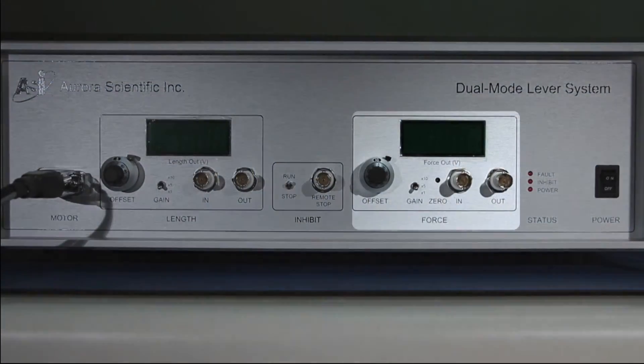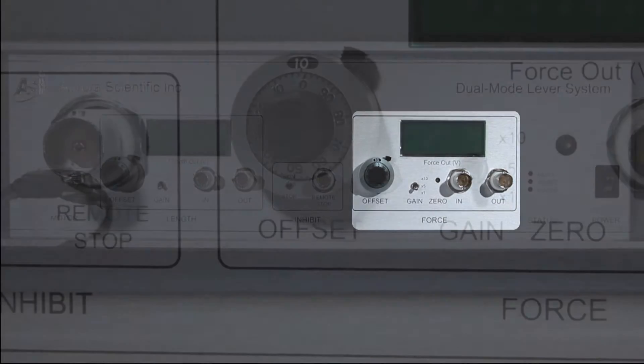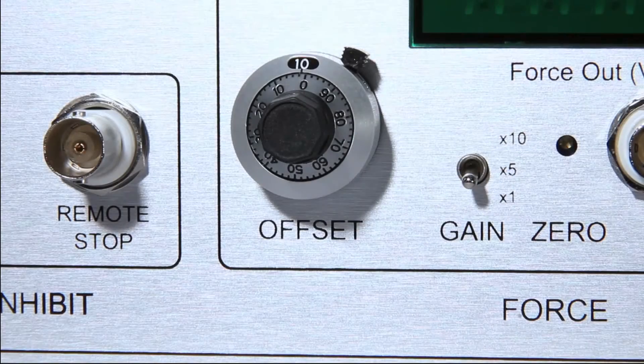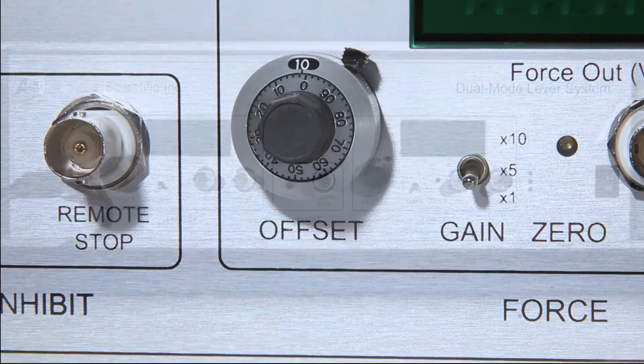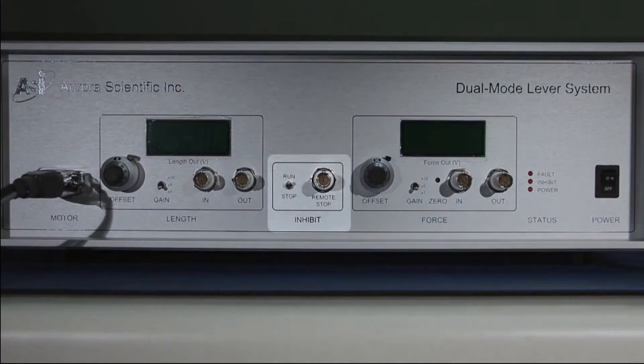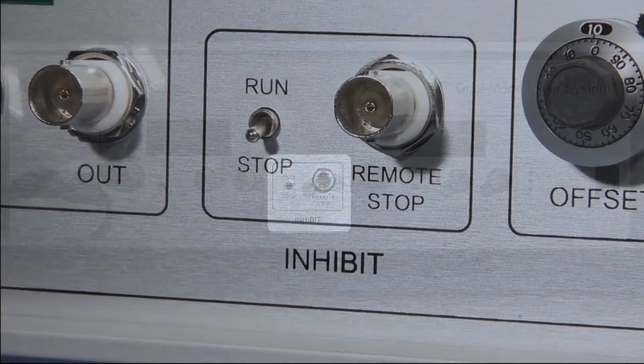The force offset should be set clockwise at 10. The inhibit switch should be set to the stop position.